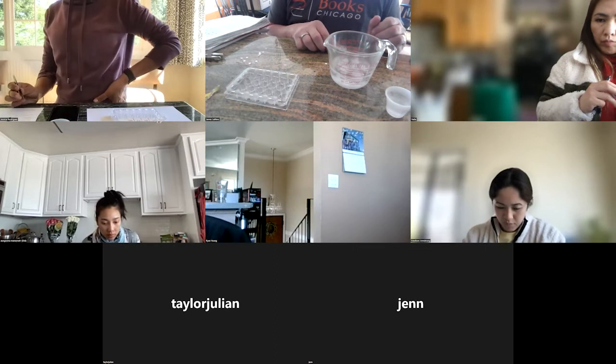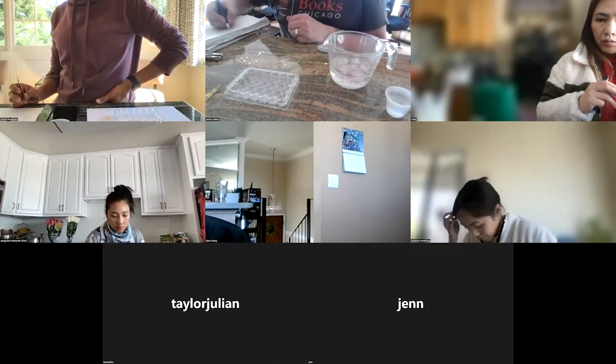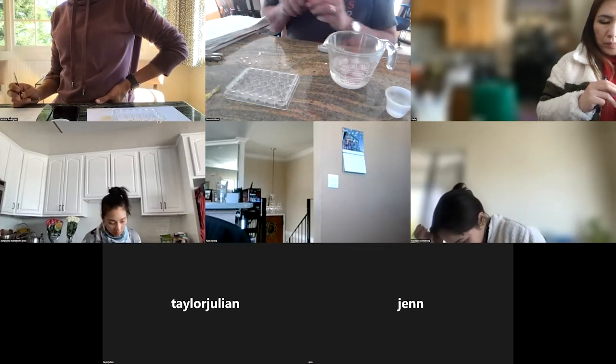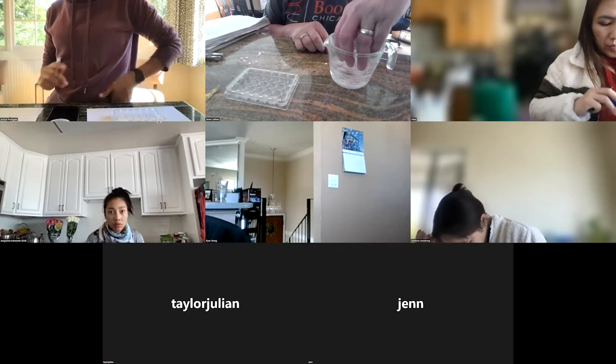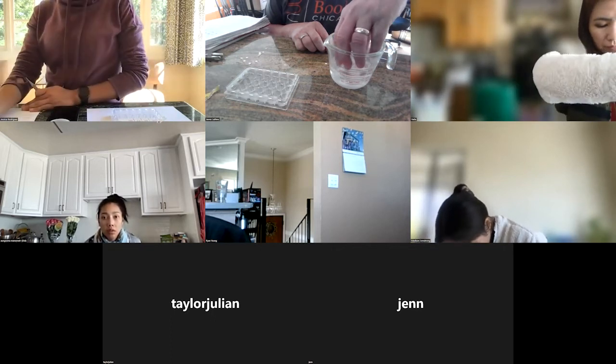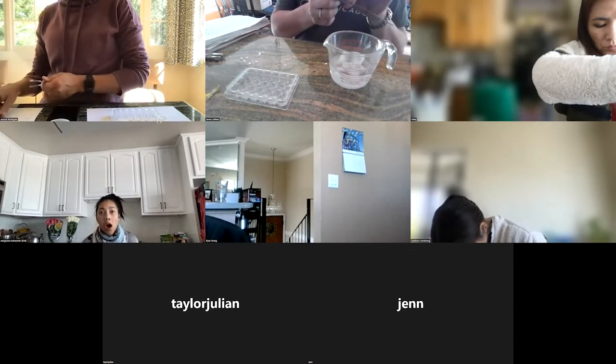So the room temperature in here is 16. So I'm just going to put it in here until it's 6, and then try my trials again.